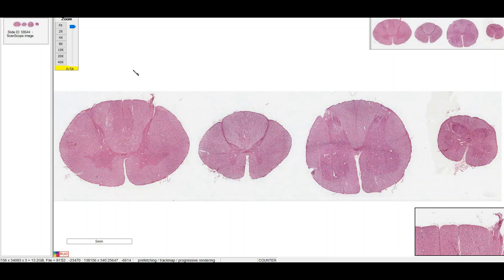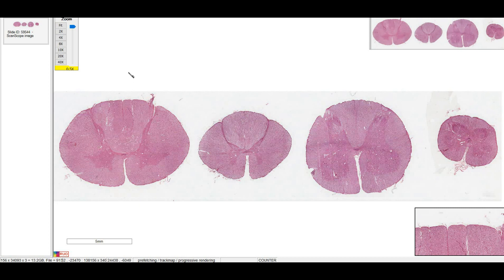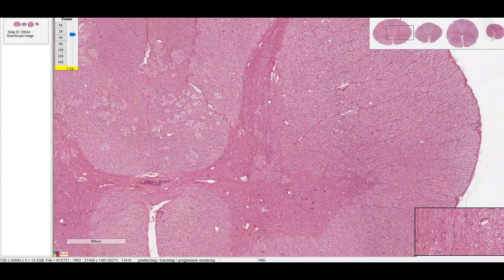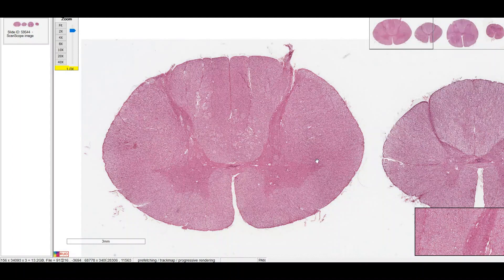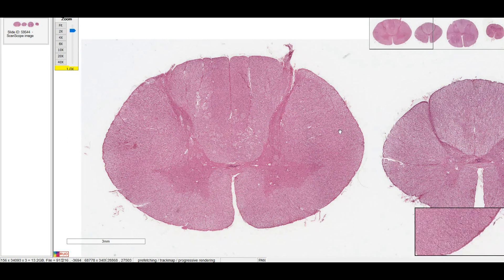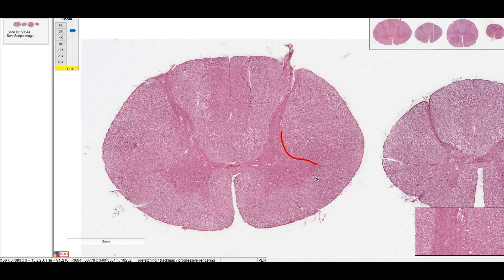This next slide is all about differentiating between the different segments of the spinal cord. Going from left to right, we have the cervical spinal cord, thoracic, lumbar, and sacral. Let's take a look at the cervical first. At low power, you can see that there's a lot of white matter relative to the gray matter, which makes sense because it has all of the ascending tracks from all the levels from below. And if we roughly outline where the gray matter is, you can see that the ventral horn here, there's a lateral extension.